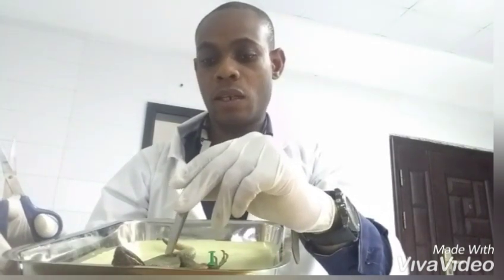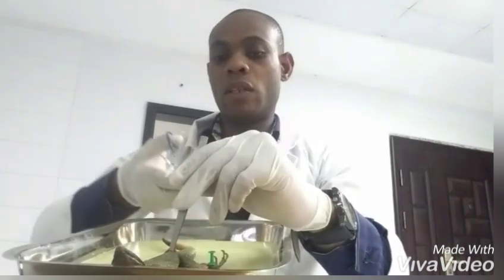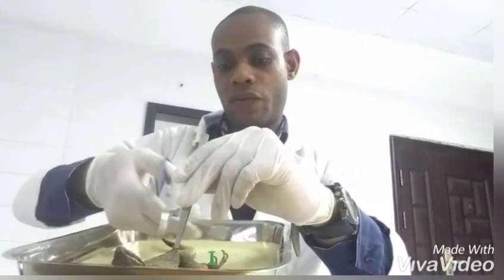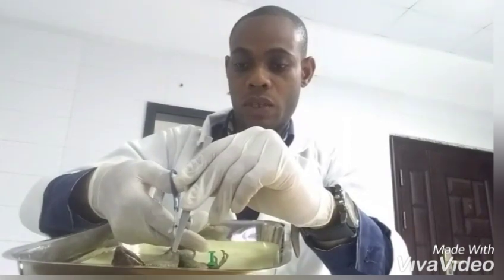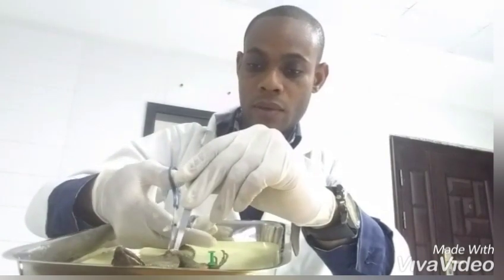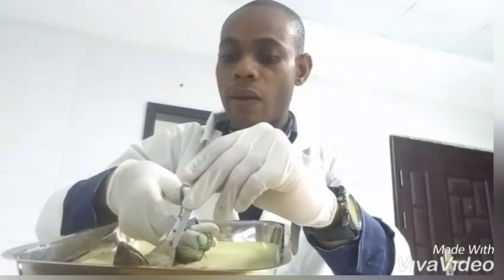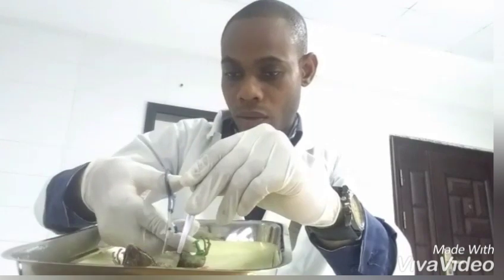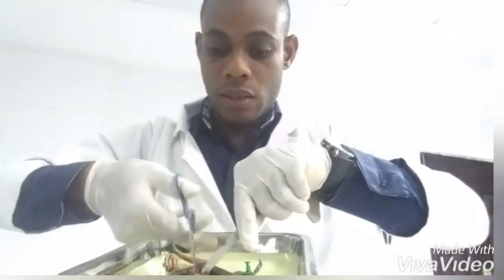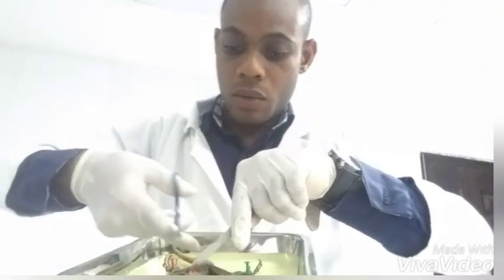We've been able to make an incision at the lower abdomen of the lizard — the skin has been cut through. We'll follow the skin and make the cut from the lower abdomen up to the neck of the lizard using the scissors. We've successfully cut through the lizard and through the fascia connecting the organs with the muscle walls.